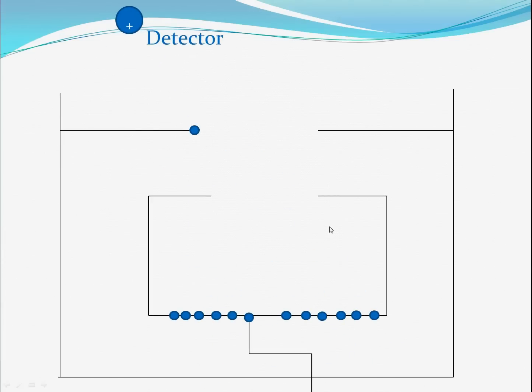Okay, so here's my detector I made. Here's some electrons in the current. Here's electrons showing how they're all around. And basically, I'm going to fire my ion, and it hits here. It doesn't hit the back of the detector, it hits here. So it absorbs an electron from the current around this whole circuit. It's a big metal box, and the electrons start to circle it, and then they're tucked away. We don't need to know about them because they didn't hit here, and this is where we want them to hit.